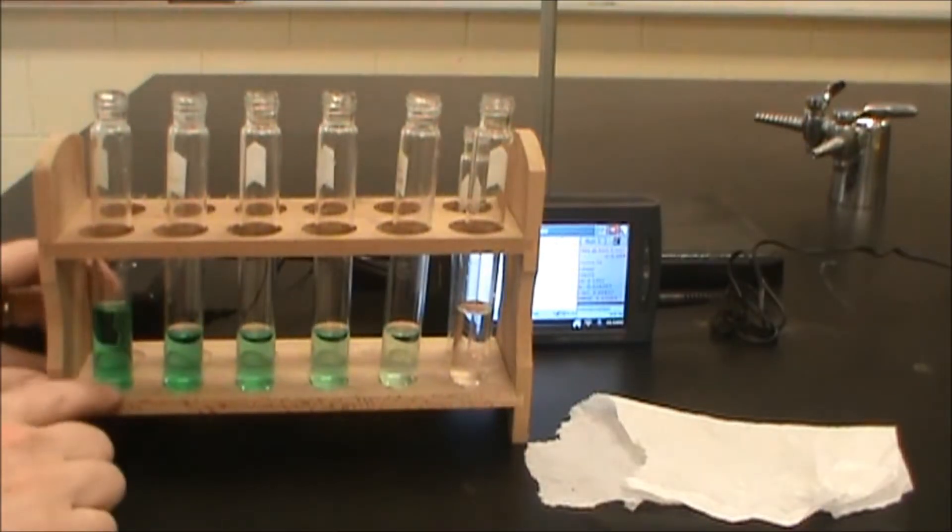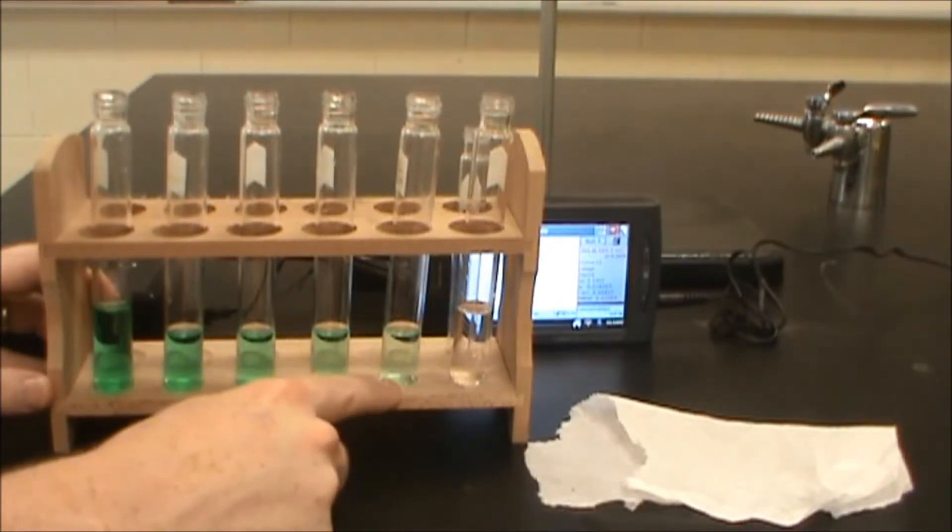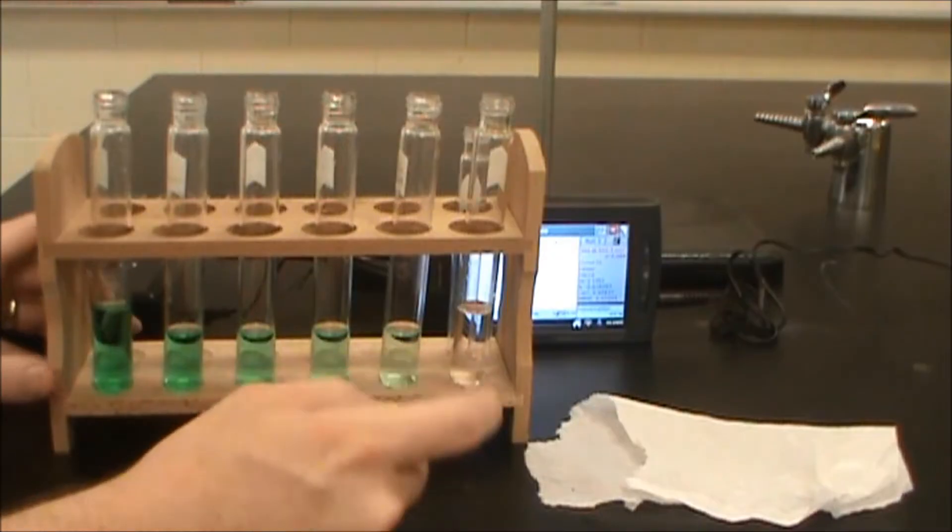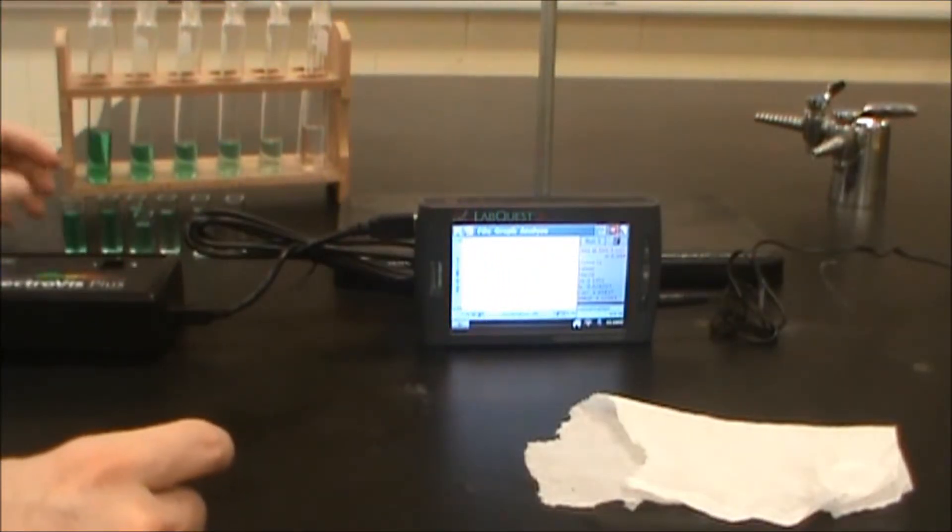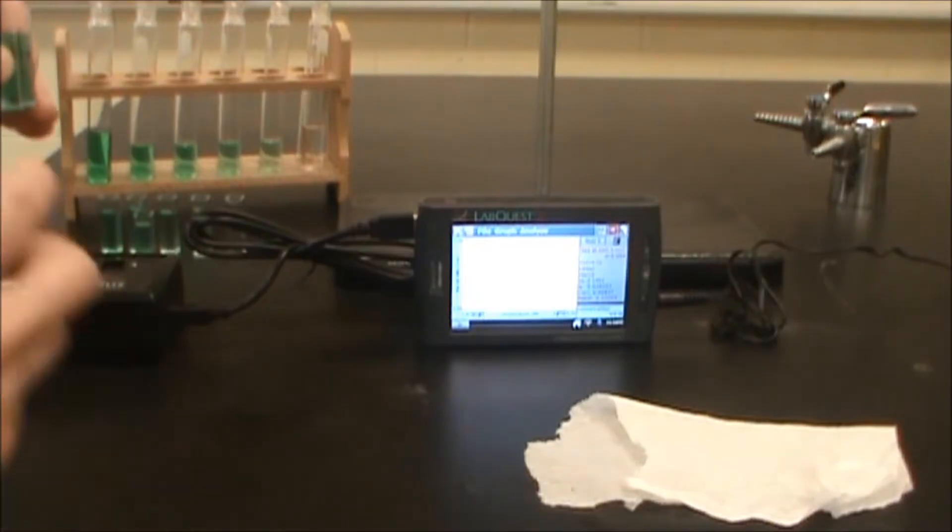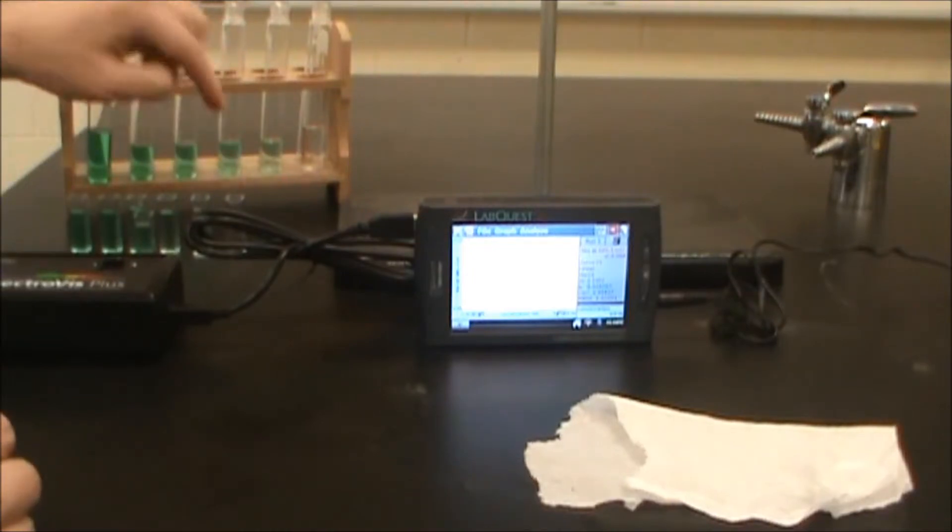So what I have here is 0.4 molar nickel sulfate solution, 0.32 molar, 0.24 molar, 0.16 molar, 0.08 molar, and then distilled water. And what I've done is I have taken each of those and put them into cuvettes. So this is the 0.40 molar, 0.32, 0.24, 0.16, 0.08, and 0.